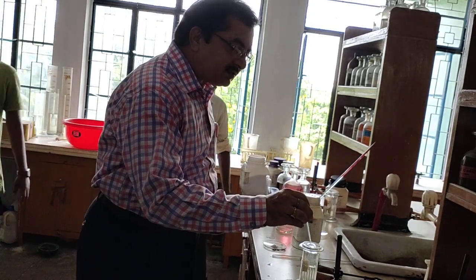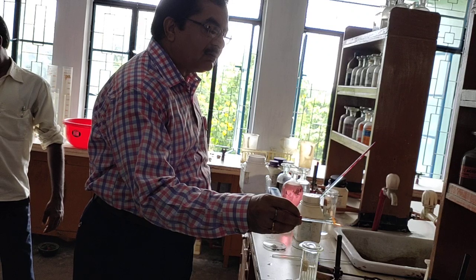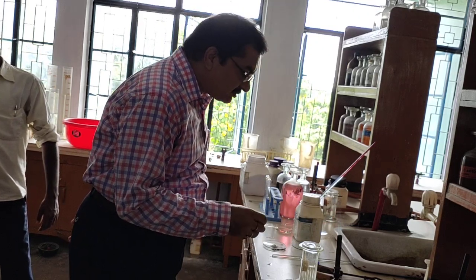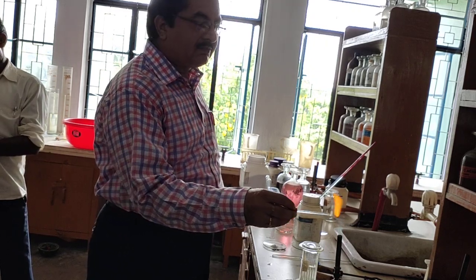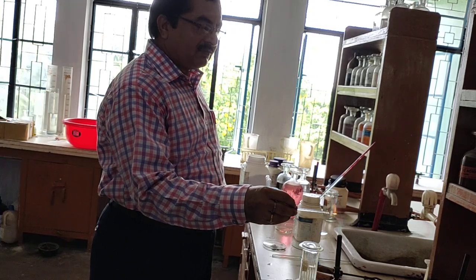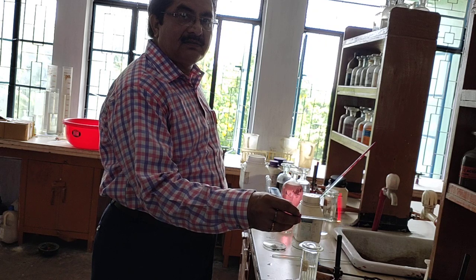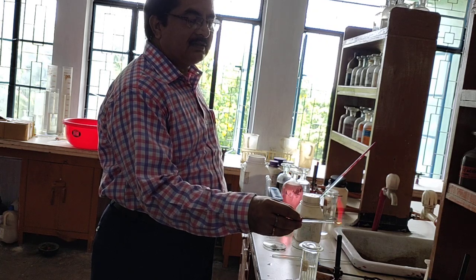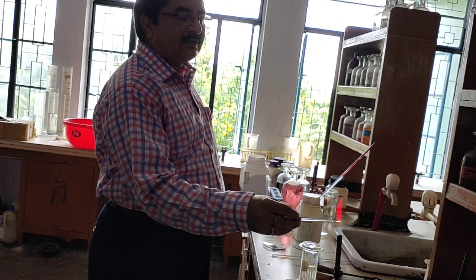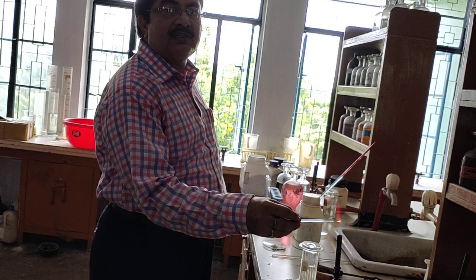Now we are going to start the next salt. Again washing the platinum wire, putting to the conc. HCl, placing to the salt, and now see the color of the flame. See, you will get the color of the flame. This time color of the flame you will get here is crimson red, just like the color when the sun rises. It shows very clearly that the salt which we are doing is a strontium salt.